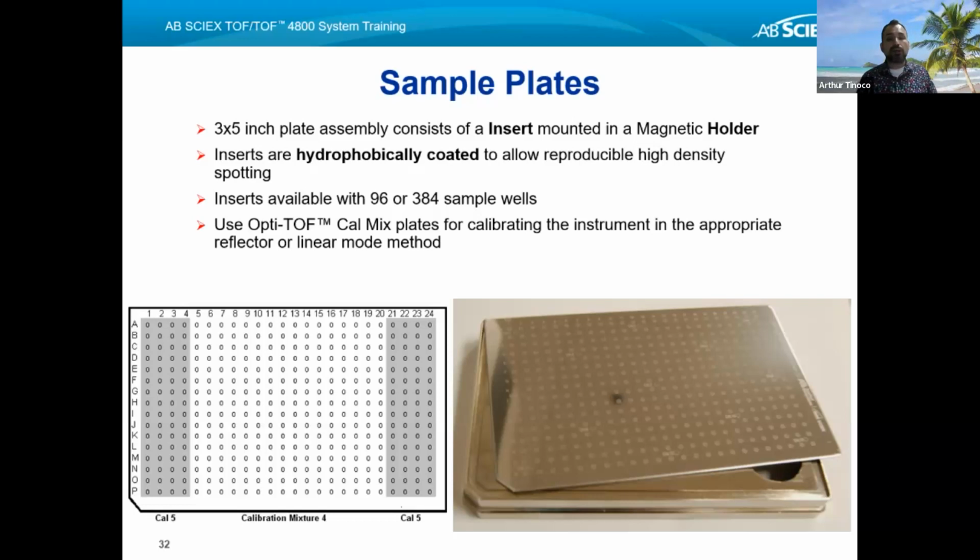That's going to be very important. So everything I measure at least twice. Sometimes I have three different preps of it, just because I want to be certain that I have reproducibility in what I'm detecting.